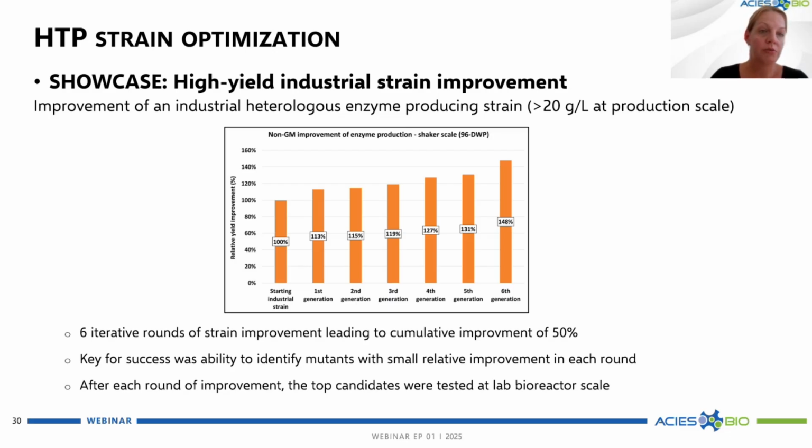So ensuring that you subcultivate the strain in the exponential phase can be really labor intensive and sometimes even impossible, because the ALE experiments often last a really long time. You usually need at least 100 generations to observe some kind of progress.